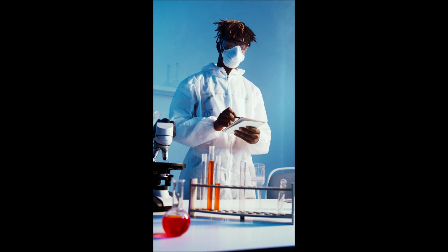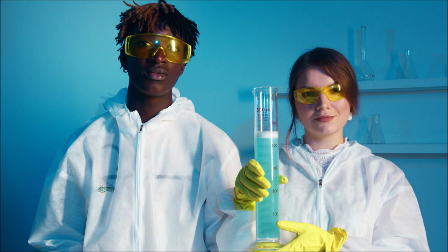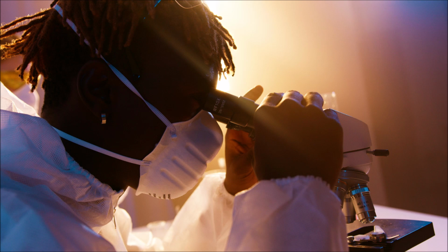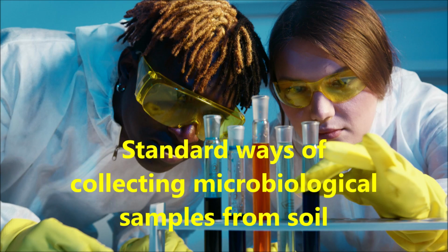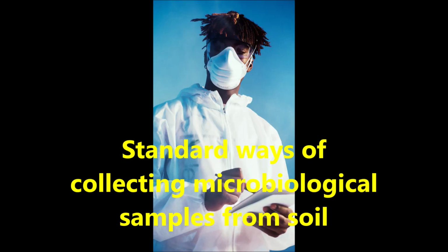So the sixth step, you have to take note of the storage and the transportation. And the last, which is the documentation, you have to record all the relevant information in the notebook, including the sample location description and the environmental conditions, which involve the temperature, the moisture, and any other observation during the sampling. So that's just the summary of how we can collect a microbiological soil sample.